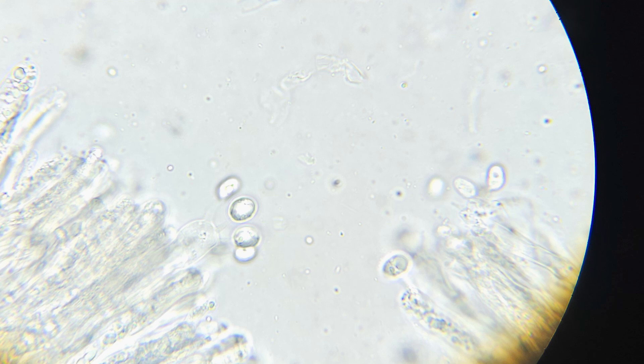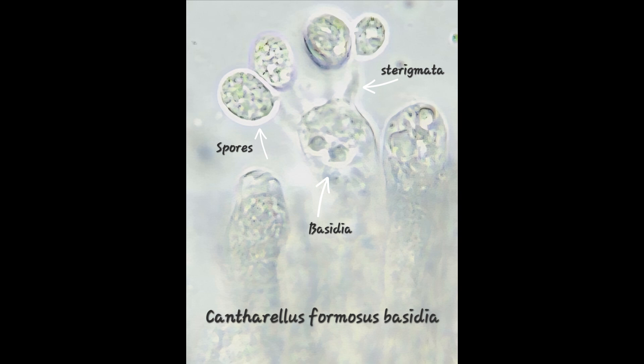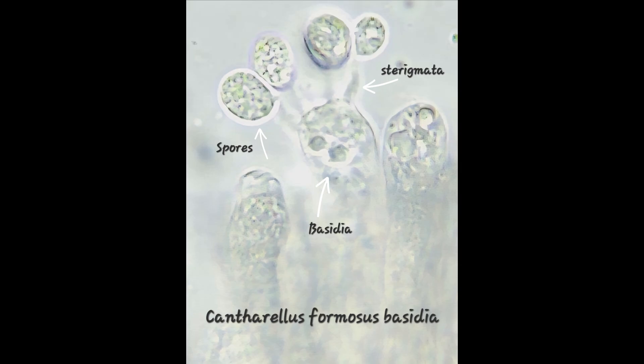Now we start to see a basidia really clearly — that was a nice shot. You can see all these little granules in the spores that are developing on the sterigma there. That's a pretty cool picture of a basidia. And here is a depiction of all of those different fungal structures: there's the basidia right in the center — that's the whole cell, a cystidia that's sexualized basically. Then there are the sterigmata — those four arms coming off of the basidia. You can see the spores with an obvious spore wall and all that granulation. A lot of spores have different ornamentation, and oftentimes there are oil droplets in there with some nutritional substance so that when the spore actually germinates, it has a little bit of a food resource to get itself started — which is really pretty cool.